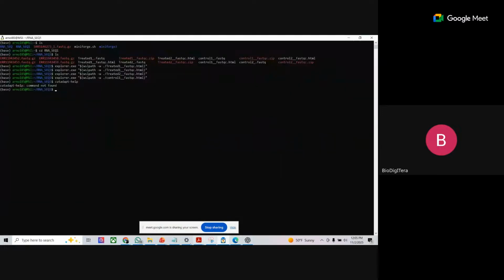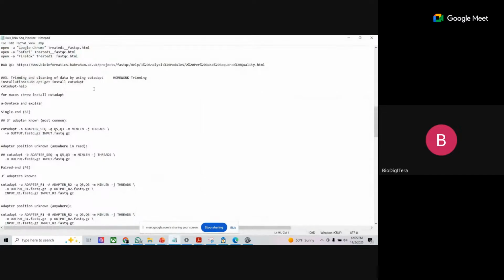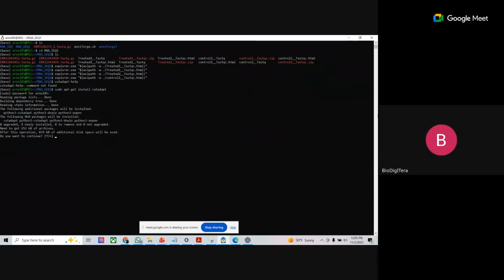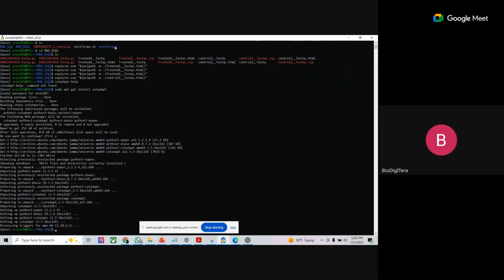Okay, now I also run the command. This is sudo. I run this command with you. When you type, it asks for your password. You type your password, enter. Do you want to continue? You type yes by pressing Y. Somewhere it will say, do you want to continue? You say yes or no. You click yes.